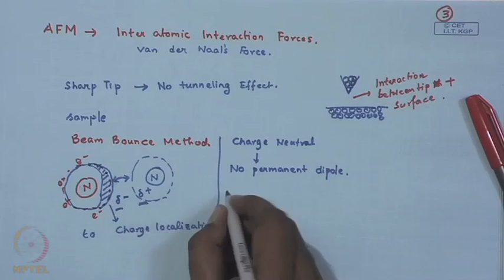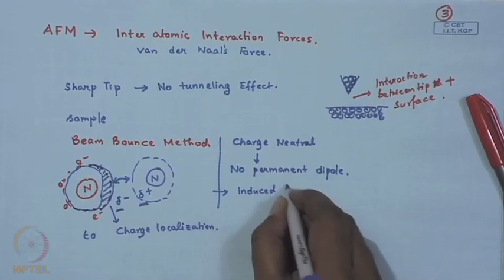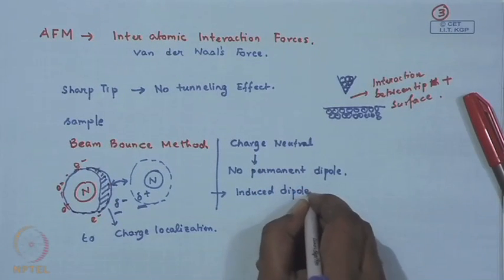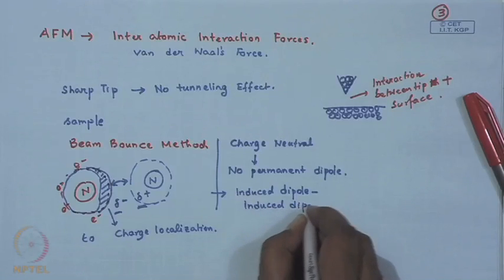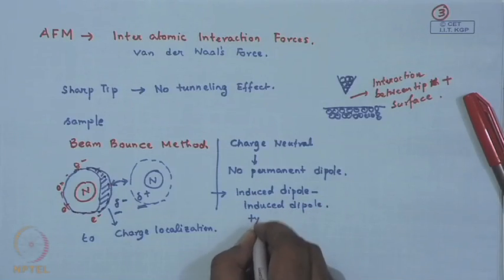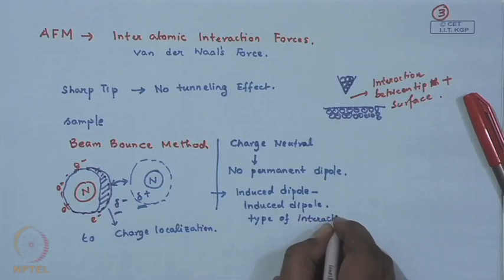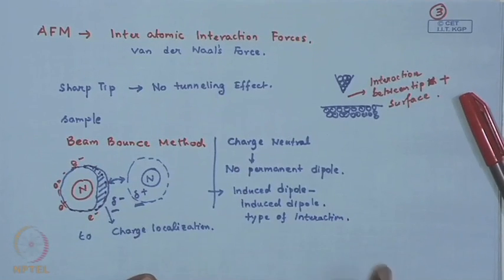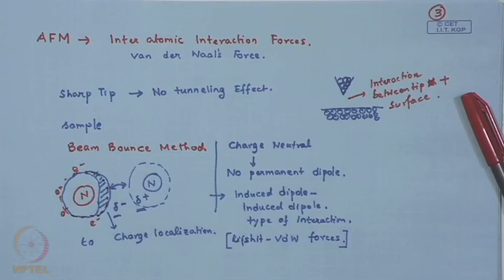So, this is the type of interaction which is known as the induced dipole type of interaction. This is what is known as the Lifshitz van der Waals forces. And this is the most fundamental form of force.